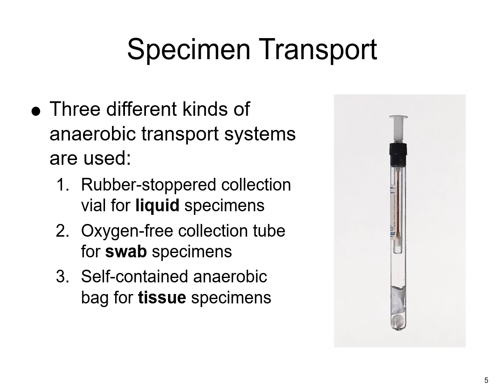And so with our specimens, when they're collected, typically we do not prefer swabs, simply because an anaerobic culture submitted on swab can be exposed to air. However, if there are cultures that are submitted on a swab, then it would need a special type of container or transport media to prevent any kind of exposure to oxygen. So there are different types of systems, swabs that are anaerobic that have a gel medium in the bottom of that collection tube that allows for that swab to not be exposed to oxygen or to the air very long.